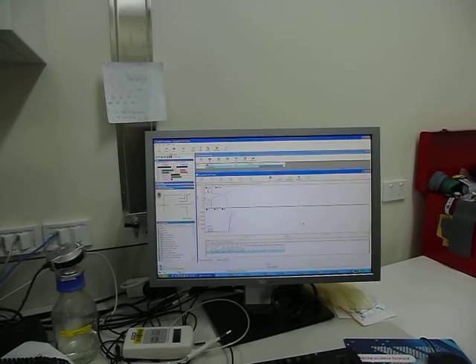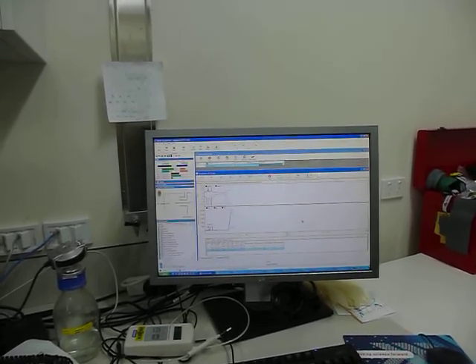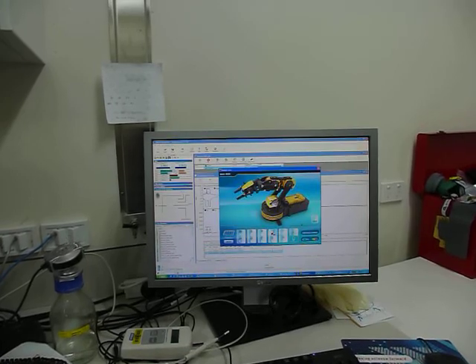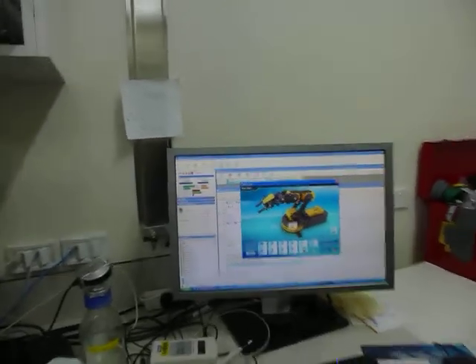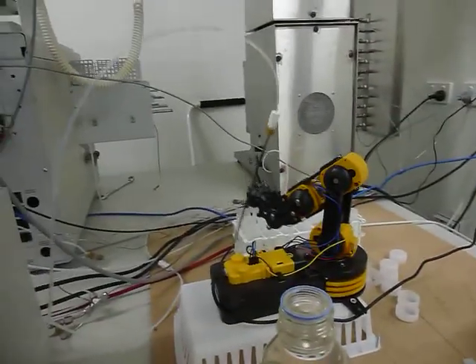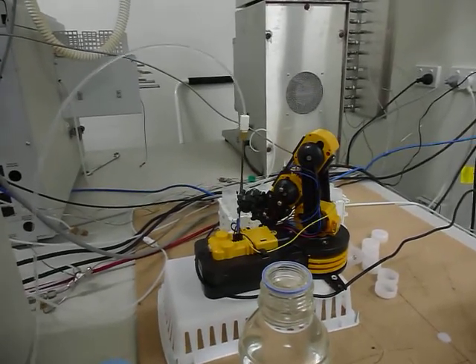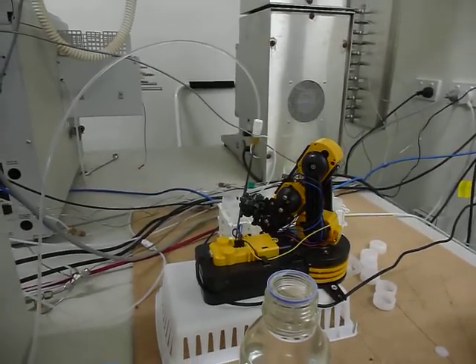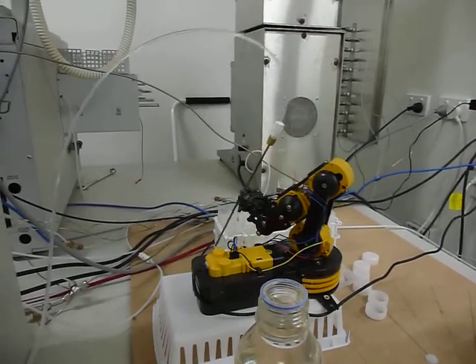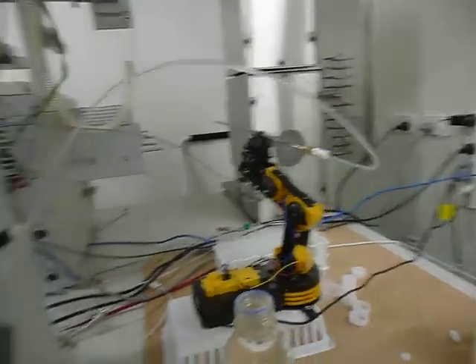Next step will be to refine this. As I mentioned at the beginning, I was surprised that the machine didn't reach the chamber. So okay, the robotic arm is moving again. It goes back to the original position. As I explained in the other video, it needs to do it every time. It goes back to the original position so that it can reach other positions after that. If it doesn't do that, it's impossible to program the movements.